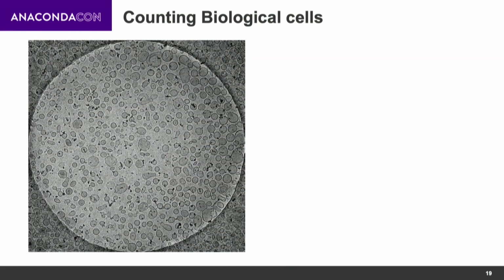People take these microscopic images which look like this. And there are multiple shapes which you see here. There are circular ones, square, and approximate other shapes. There are 4 shapes which scientists look out for here. And each of these shapes have to be counted.